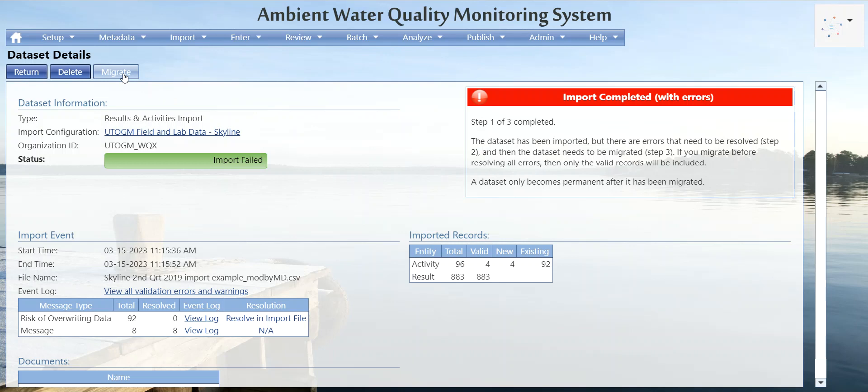That is how to import your field and lab data. This file isn't a perfect example since some of it already exists in Aquums, but that is the general flow of things. If you have any questions, please feel free to reach out to us.